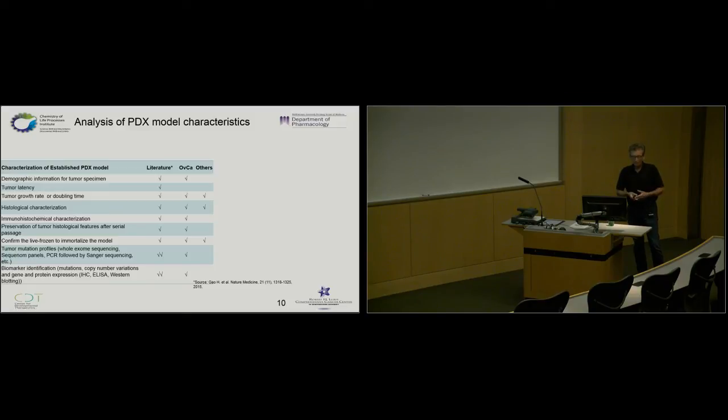We're happy to hand these out to people, but rather than do a generic set of characterization that may not be useful to all people, we prefer to do the basics, and then each person can analyze it in any way that fits their research program. And so in our shop, we will typically do some of the growth rates, some of the histological characterization, occasionally immunohistochemical characterization, where there might be some question regarding what the tumor is.